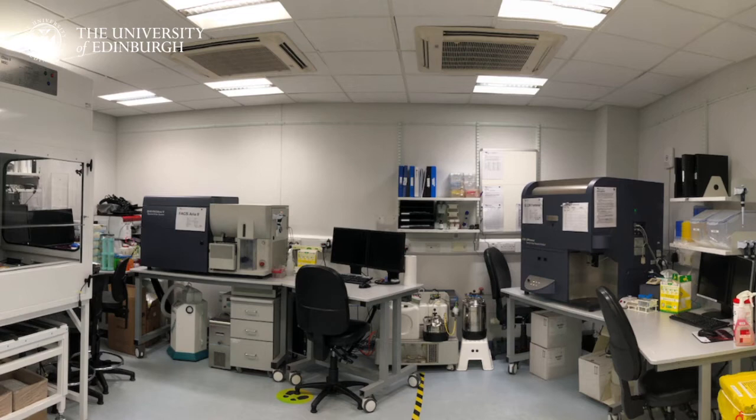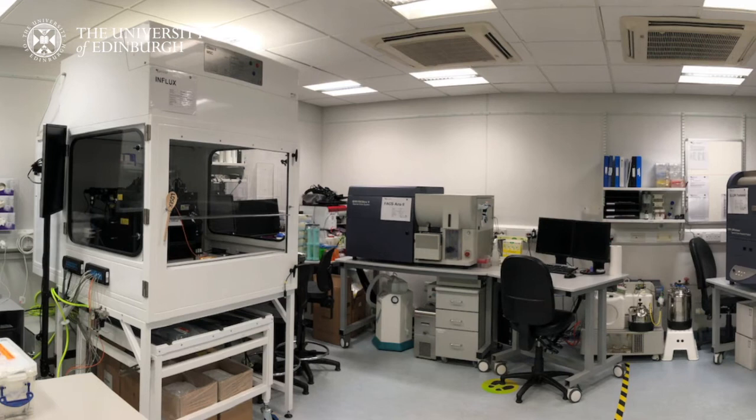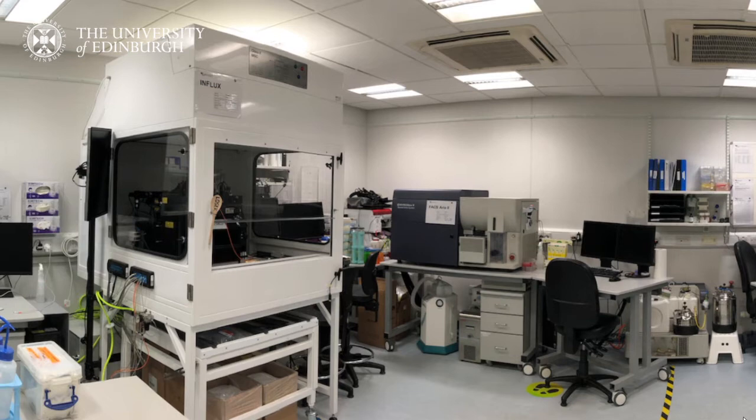This is the flow cytometry facility at QMRI. Flow cytometry is a technology used to measure different parameters or characteristics of cells or particles flowing in suspension past a sensing point, whereby the laser interacts with the stream and the emitted signal is collected by detectors for real-time analysis. Fluorescent tags for intra- or extracellular markers can be added to these particles to further define subpopulations.